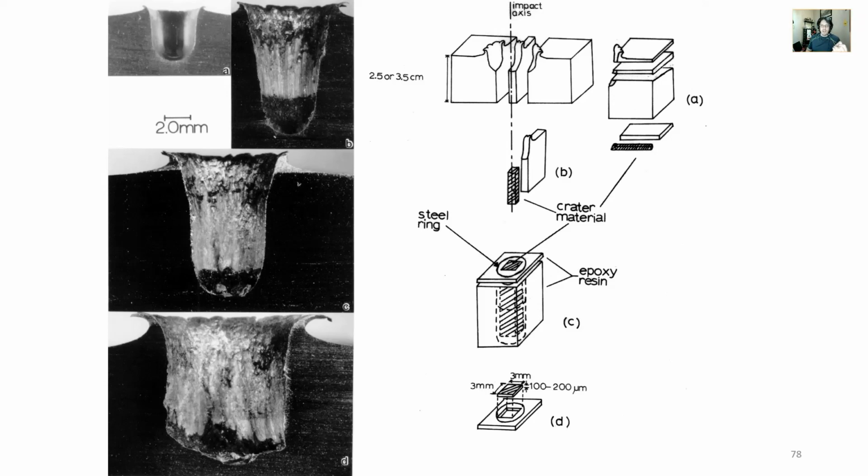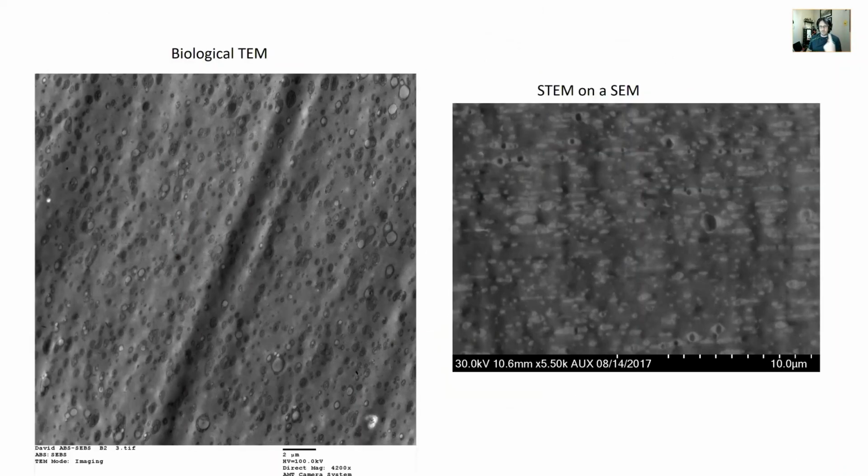If I'm using a TEM where I'm putting one specimen in at a time, you have to take your specimen out, cycle the chamber holder to bring it to atmosphere, then take it back down in the vacuum, it's a lot of time. If you have an instrument like what I have where I can look at 12 at a time, it's a time saver actually. So I can make 10 specimens one day, look at all of them either the same day or the next day. Anyway, kind of rambling on, but there are differences between STEM and TEM.